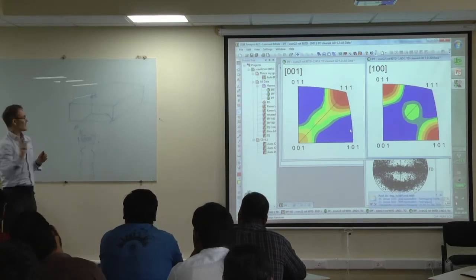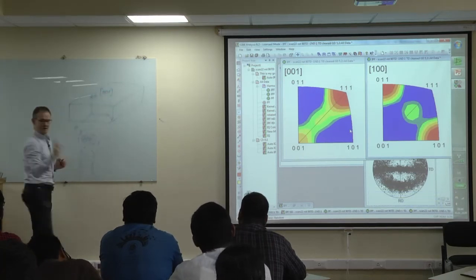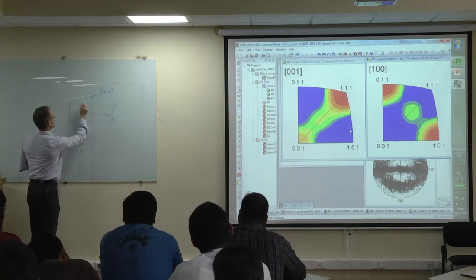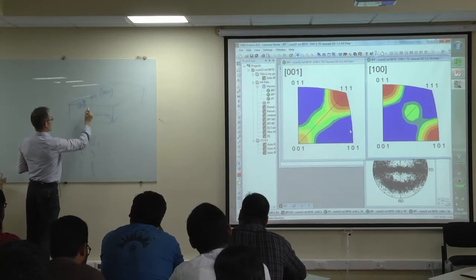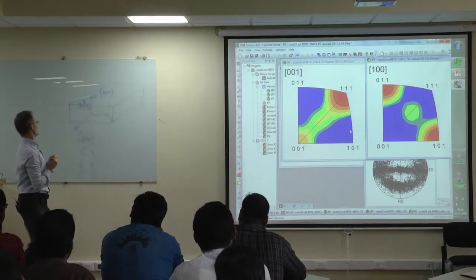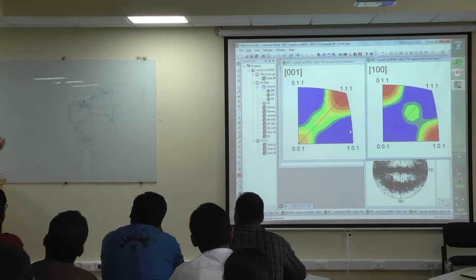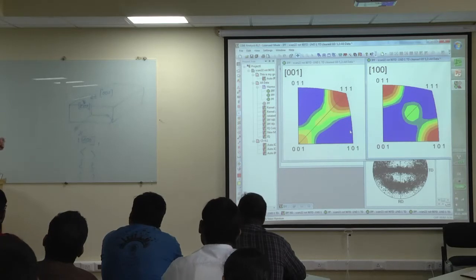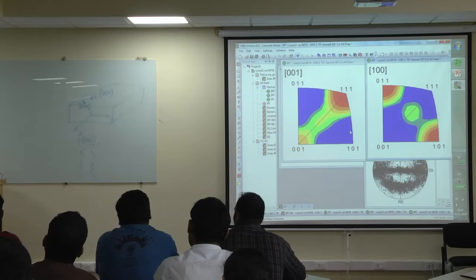But now you could say, anyhow, I don't need to look exactly into one of these directions. I could also look into a direction which is somehow inclined, which would be, for example, 2 in x, 0 in y, and 1 in z. That would be some inclined sample direction. Why would one like to do that? Why is it not always important to see into these sharp directions of my sample? First, in geology, that may of course be irrelevant anyway because your sample has been sheared somewhere relative to the cutting out of your sample.